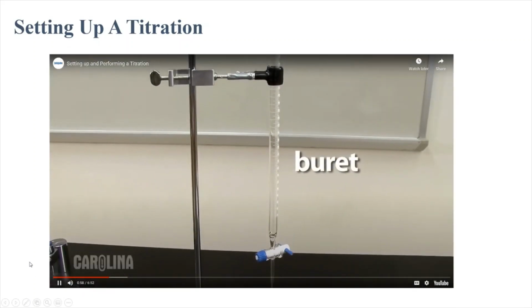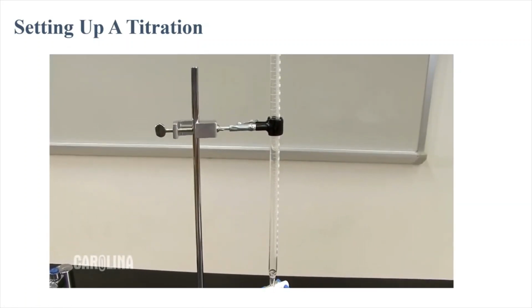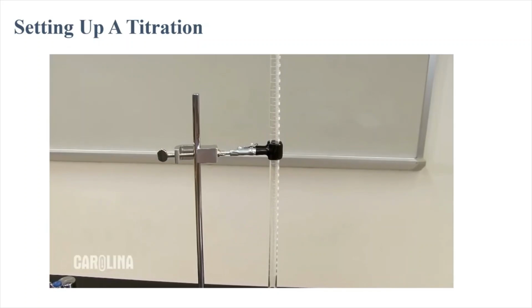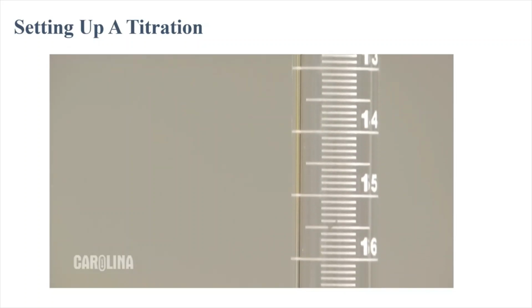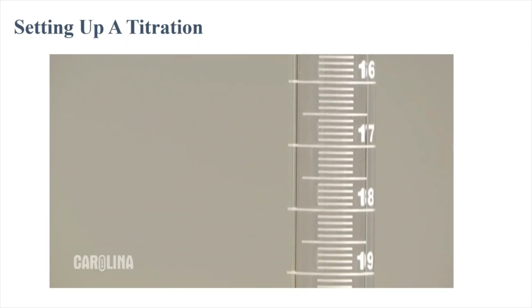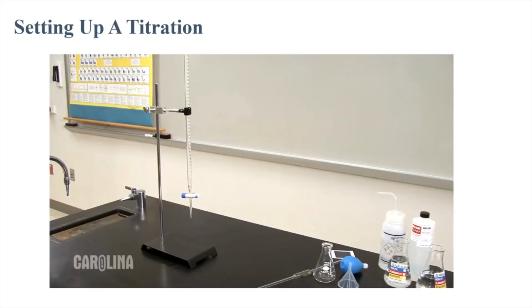Including a burette, ring stand, and a burette clamp. A burette is a long, narrow, graduated tube used to add titrant. It has a stopcock to regulate the flow of liquid. Notice that the markings on the burette go from lowest at the top to highest at the bottom. The ring stand and burette clamp are used to mount and secure your burette.